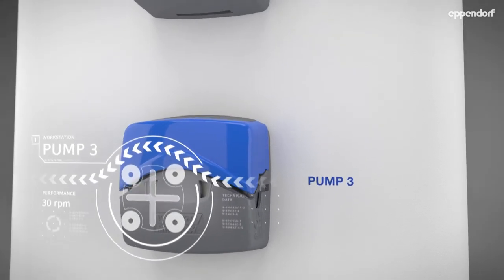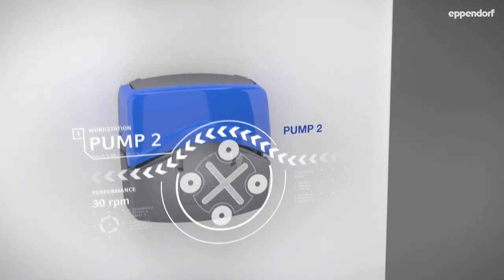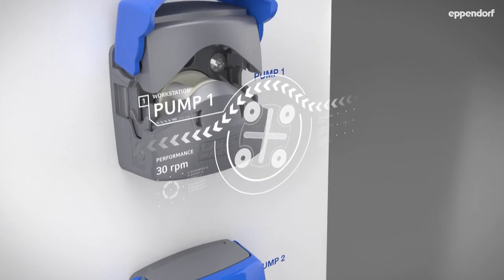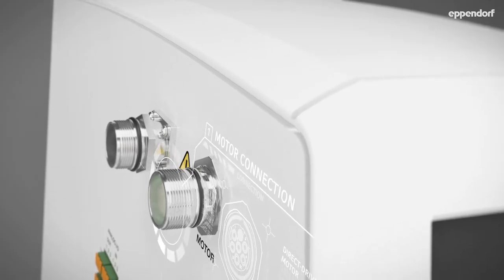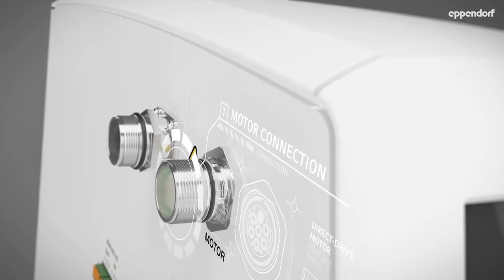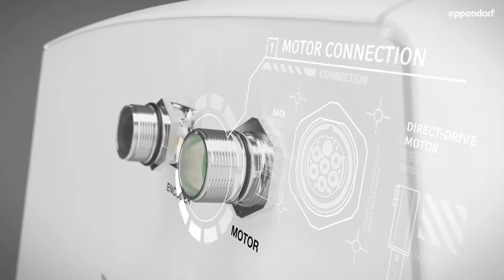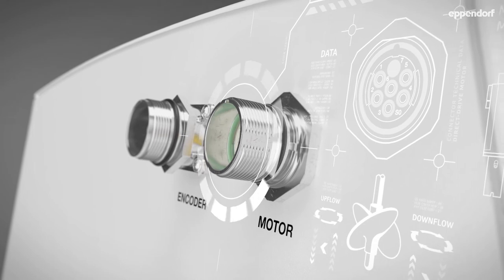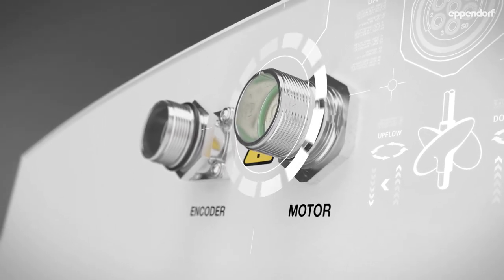Three industry-standard front-mounted peristaltic pumps provide reliable control of feed and harvest applications. The utility panel houses all locations for vessel connections, providing a simple and straightforward setup. Direct and magnetic drive motors are interchangeable, and our unique bi-directional magnetic drive motors add an extra layer of flexibility by providing upflow or downflow mixing.